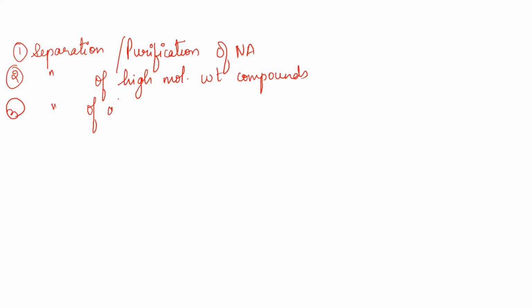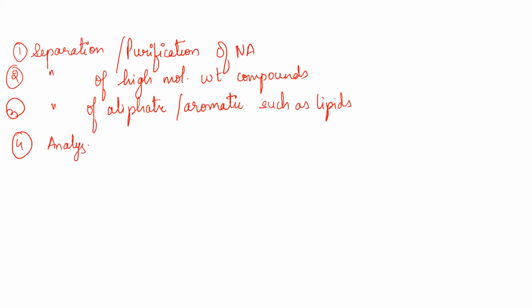Third, separation of aliphatic and aromatic compounds, such as lipids. So again, these are biomolecules we are talking about. Fourth, you can analyze or detect plant pigments or fat soluble vitamins.